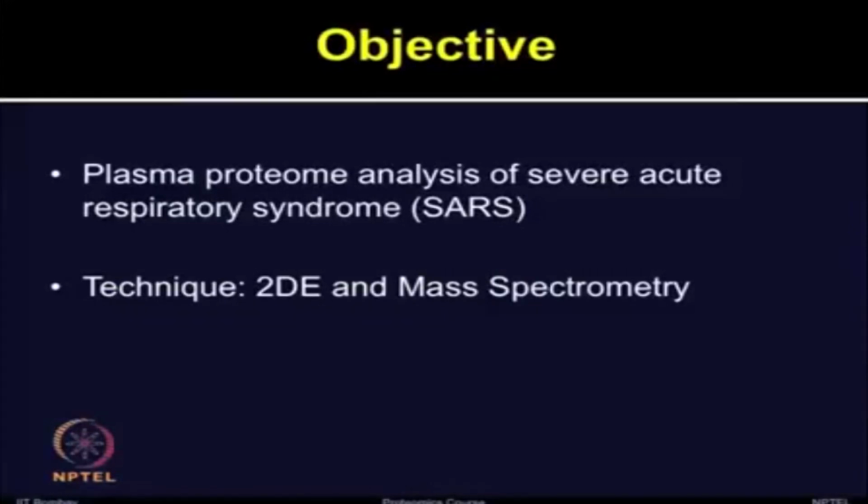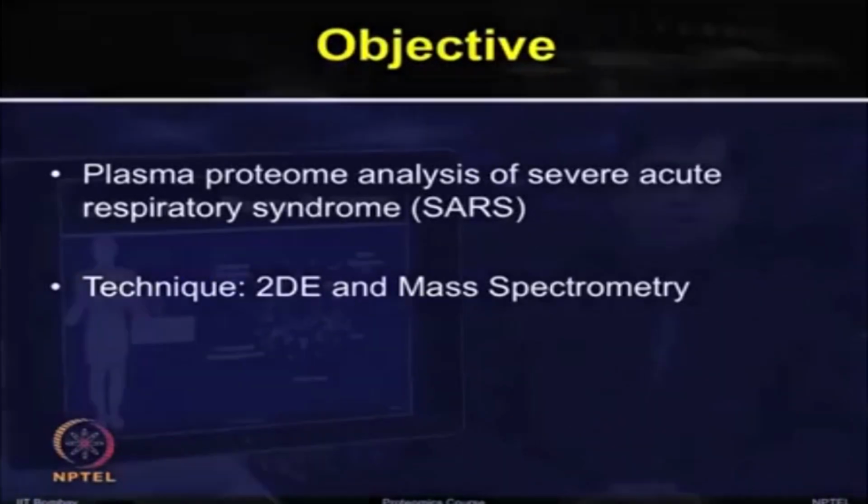In this study, authors employed conventional two-dimensional electrophoresis, analyzed those images from the treatment with the controls and identified the differentially expressed proteins by using mass spectrometry techniques, including MALDI-TOF and LC-MS/MS. Finally, the interesting identified proteins were validated from techniques such as Western blots.